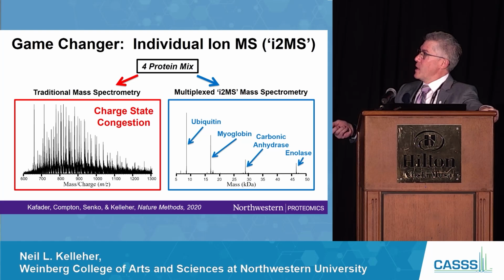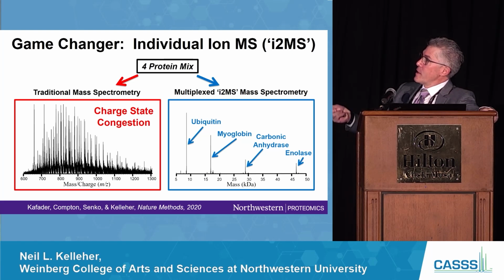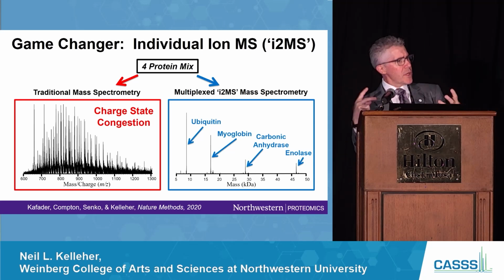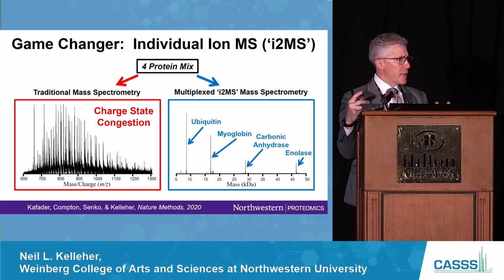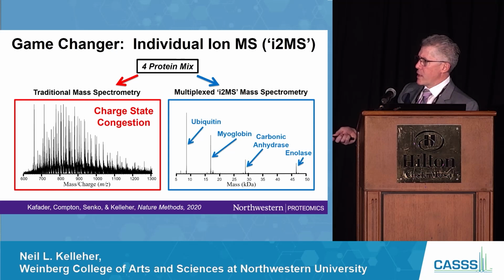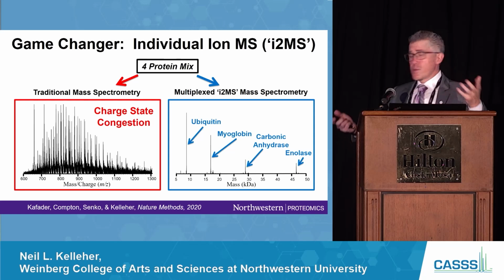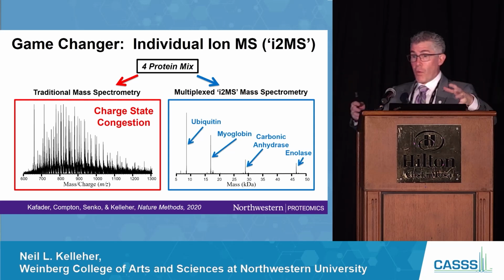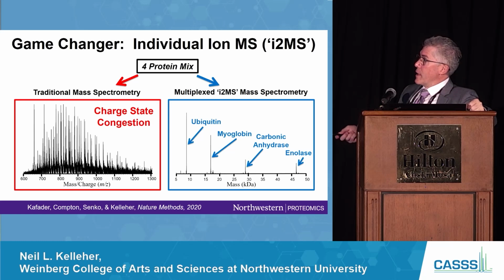So here's now a 4-protein mixture, all the usual suspects, what you might expect. There it is as a mixture, right? And if you get a really complex mixture for electrospray, denaturing electrospray, this starts to turn into a hump, and you can sort of see it becoming that way, which is why electrophoresis with separation of things was so critical for a long period of time, and why we got into it for top-down.